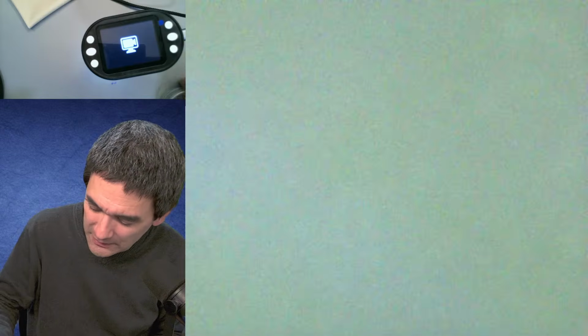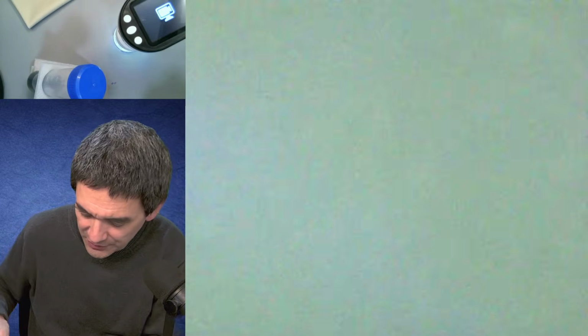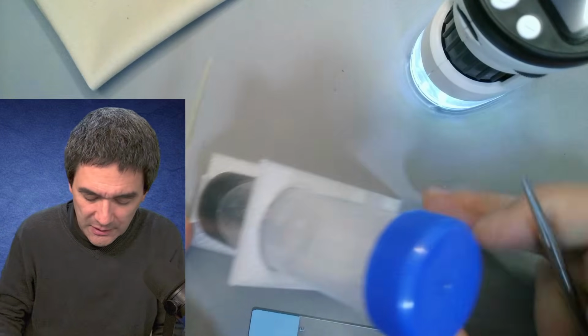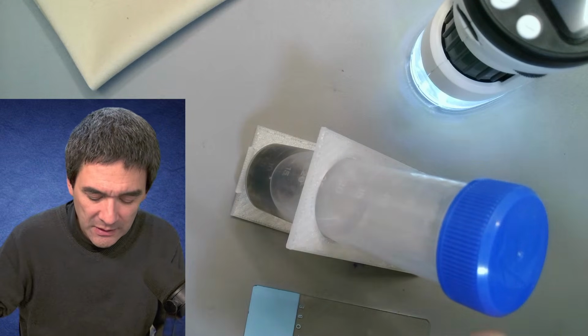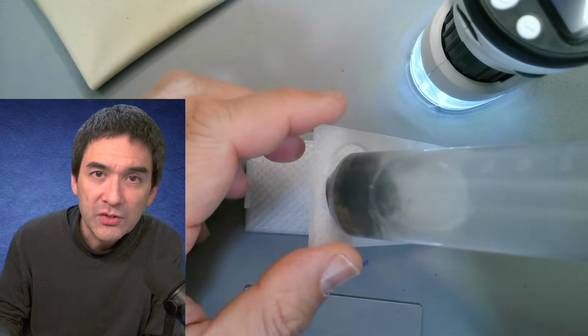So let's do the following. Let's look at a couple of diatoms, okay? Because I do have a list here of a few things that I wanted to show you. If you watched my video that I published a few days ago, the reason I was not around last week is because I was away with one of my kids, and I therefore wanted to take along a water sample. Here, this one over here. We just scratched off the surface of a rock. So basically just watch my previous video. What I'm going to do now is have a look at this, because this will also be the specimen that at the end of this live stream I would like to add some hydrogen peroxide to, to extract the diatoms.